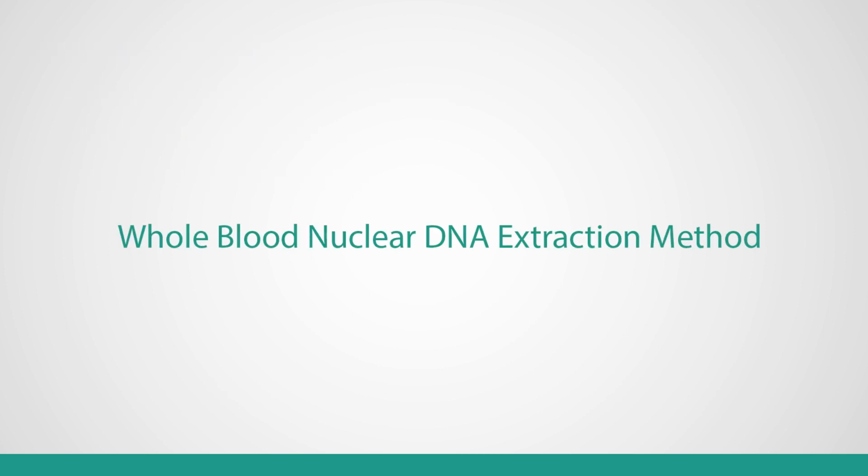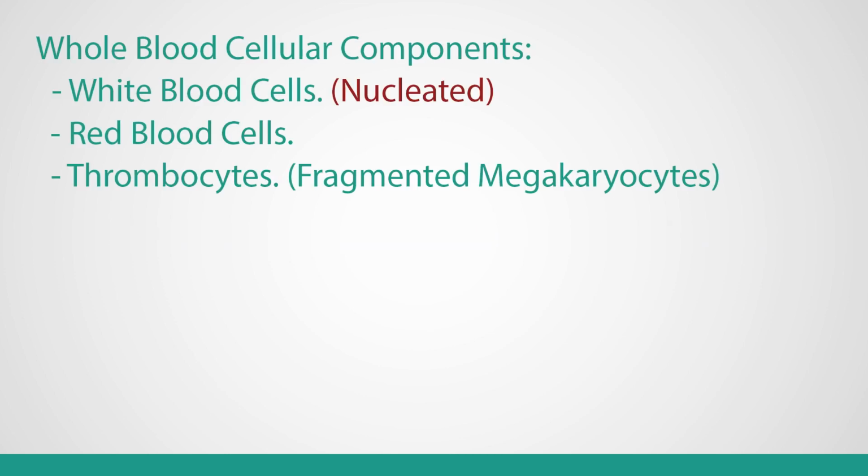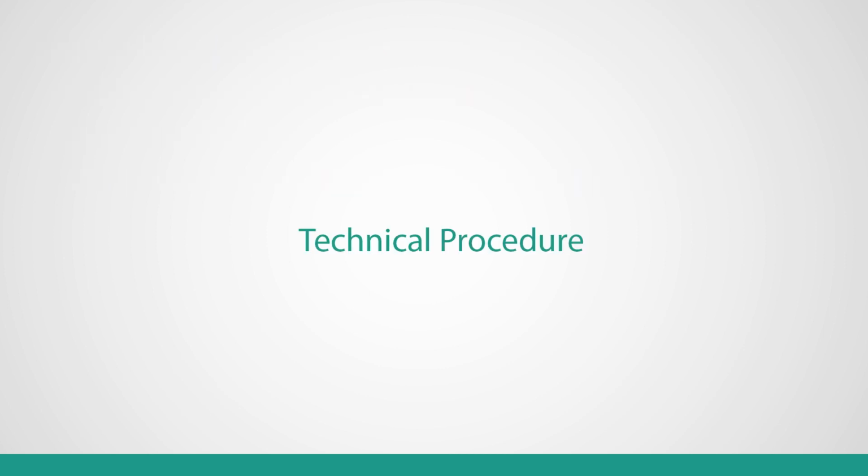This video will focus on extracting the DNA from whole blood samples. In whole blood samples, the DNA is found inside the nucleus of white blood cells because it is the only nucleated cellular component.